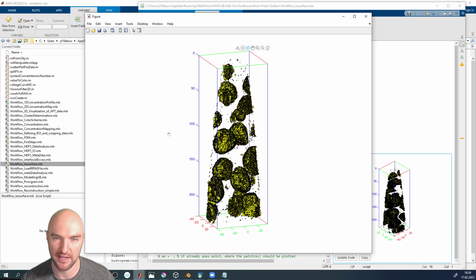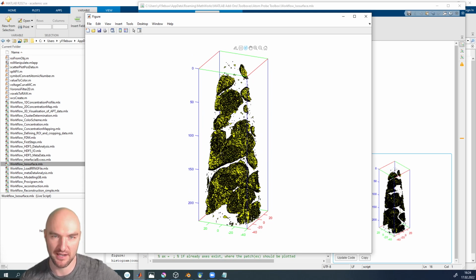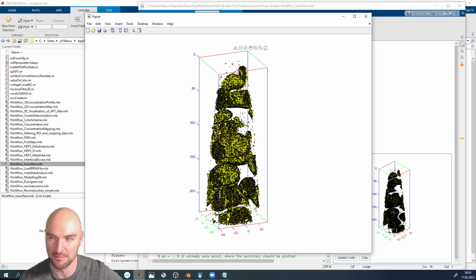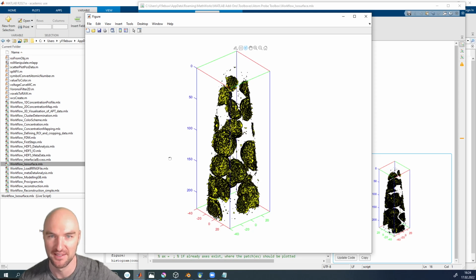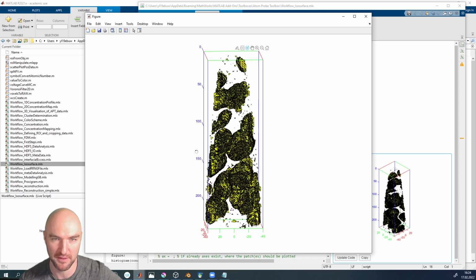Now tomorrow we're going to get into how to manually outline objects, because for objects that are not topologically spheres, you don't get topology for free. So you have to create the topology yourself. If you come up with an algorithm that creates a topology for you, leave atom probe tomography and sell it to Microsoft or Apple for millions and millions of dollars. Unfortunately that's not a thing, so we'll have to create the topology by hand.